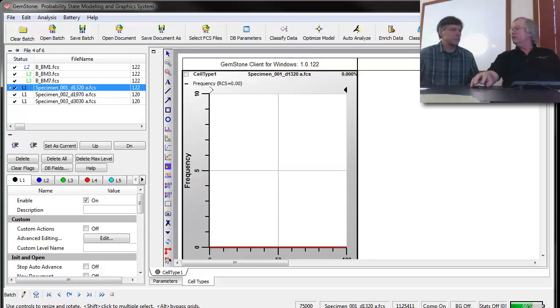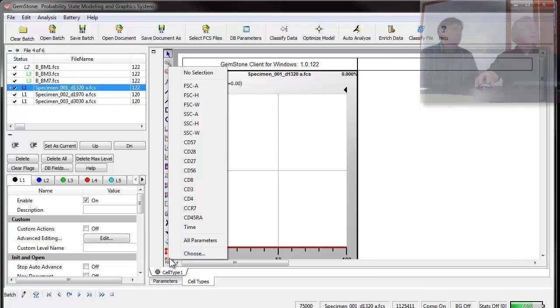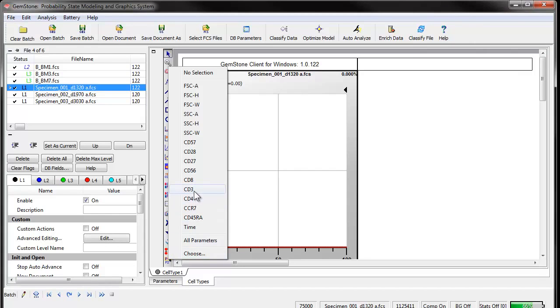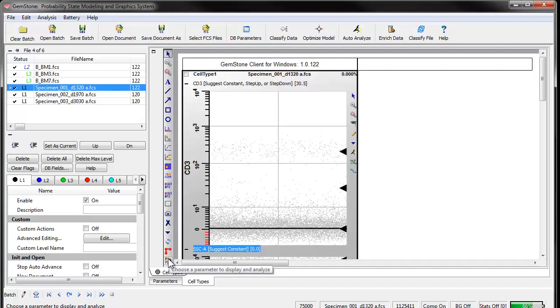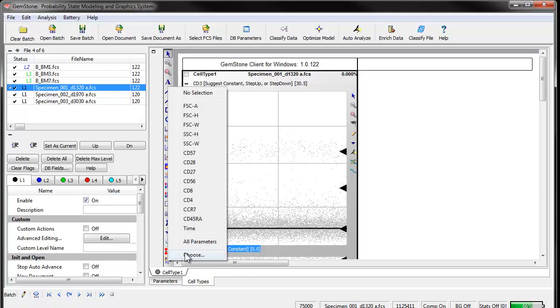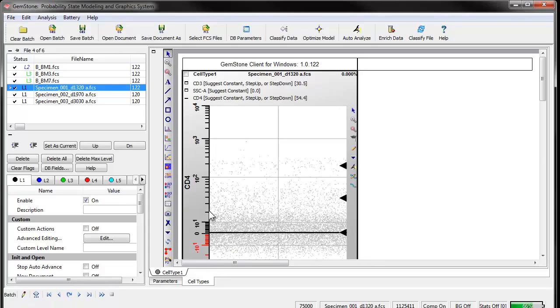Quite a number of events in this file. There's over 1 million, Ben. And you'll note that there's actually also quite a large number of correlated measurements here. So like the B cells, we picked our key selection markers, which are going to be CD3, side scatter. We usually couple scatter with a fluorescent marker. It sort of cleans up the marker. That's what we did with the B cells as an example. And then we'll pick CD4 and CD8. Okay. We'll deal with the other markers in the next tutorial.